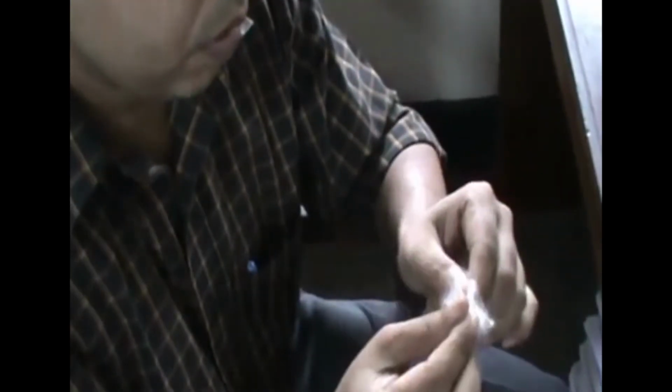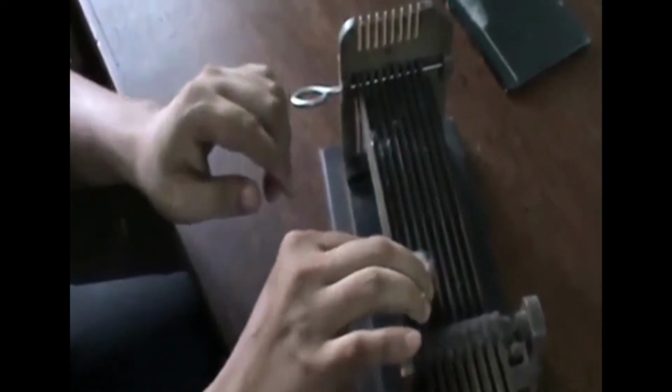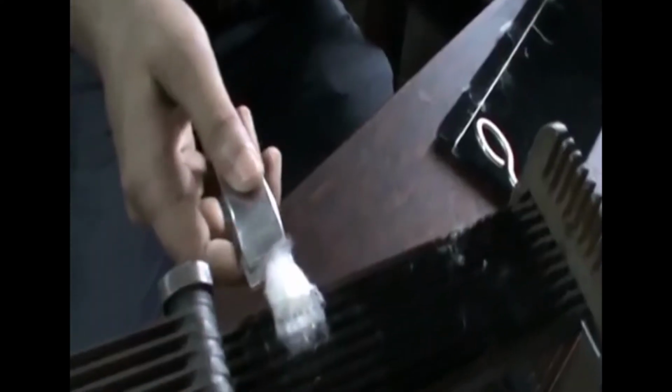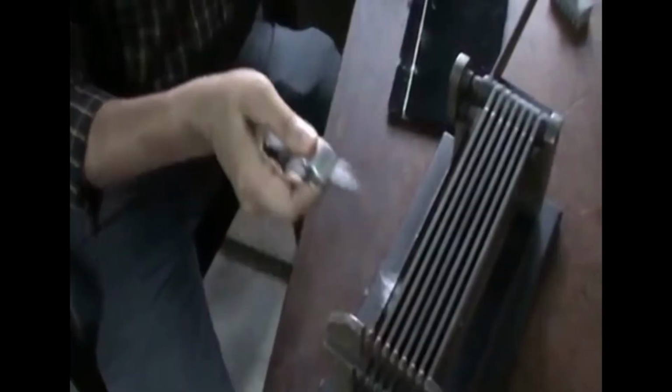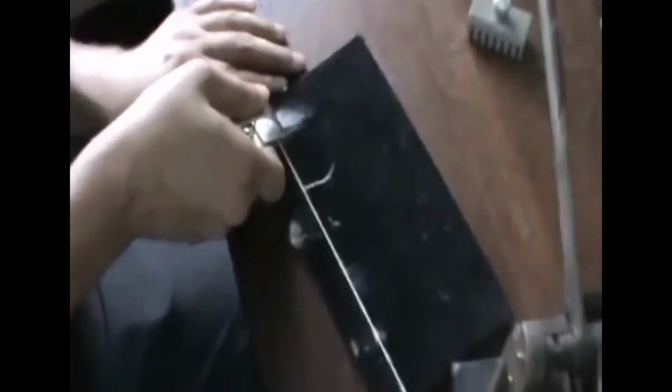The process of sorting is done in the following manner. First, the sorter is placed with the back towards the operator and the prepared sample is rolled or very slightly twisted and placed in the combs at the right side of the sorter as it faces the operator, with a small tuft protruding. Next, by means of a grip, all loose hairs are removed from the protruding end until there is a straight edge, and the loose hairs pulled out are placed between 2 glass slides.